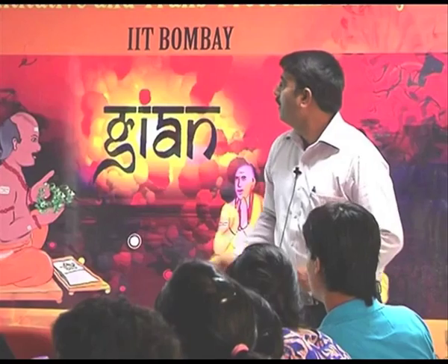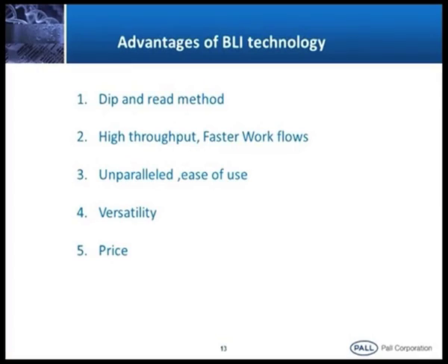So the advantage of BioLayer interferometry is that it works on the dip and read format. In a 96 well plate we put the antigen, antibody and all that. The sensor will move like this and we can read. And another advantage is that there are no microfluidic devices.